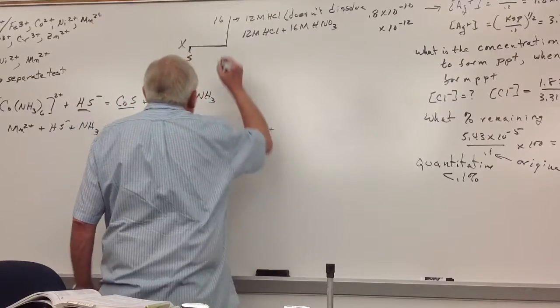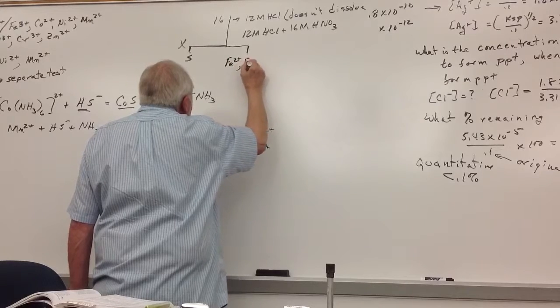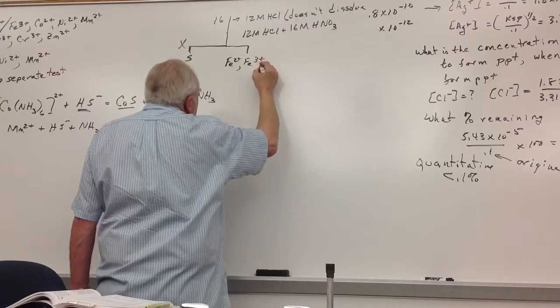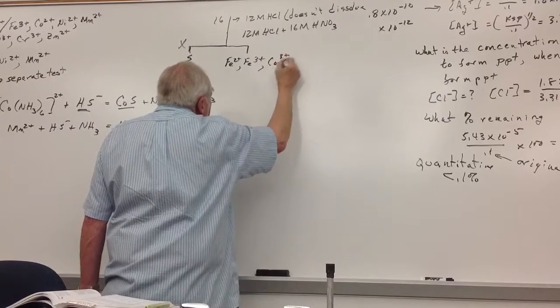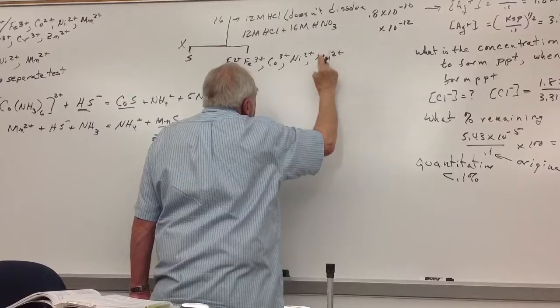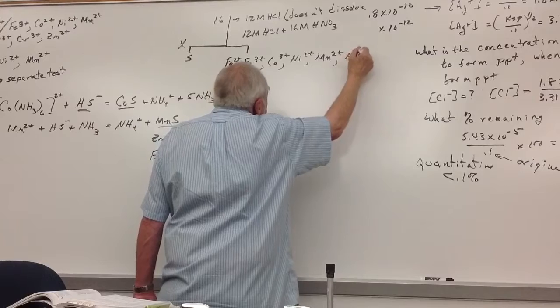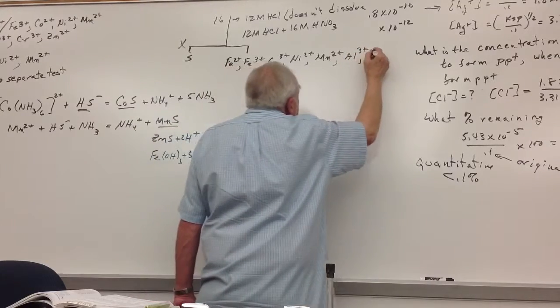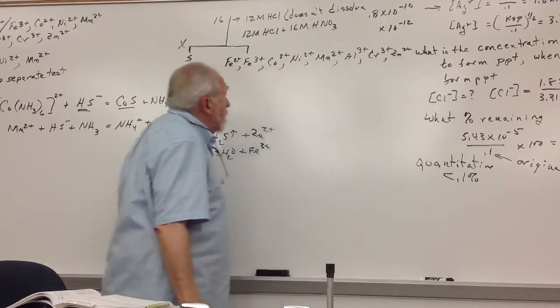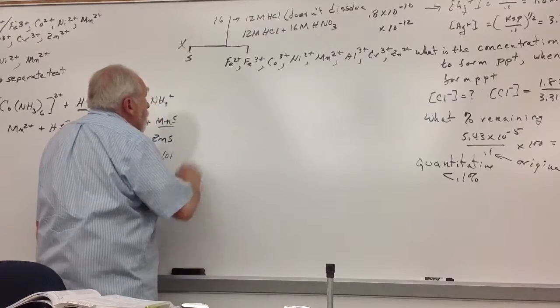So what we have here, notice if you use aquaregia, you're going to have a lot more of this than this. You could even get the cobalt 3 plus. So you probably aren't going to bring this up to permanganate state yet, but you'll have aluminum, chromium, and zinc. Now here's the separation step. You're adding NaOH.